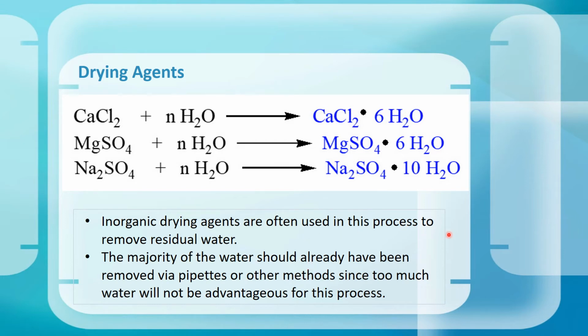So that is something to keep in mind if you want to be sure you're not going to have to use too much salt, because some of these aren't as nice to play with as others. They can be very messy in some cases. They can make interesting things on the bottom in terms of sludges and stuff like that if you have to use too much. So it's always good practice to dry as much as you can before you have to use the drying agent.